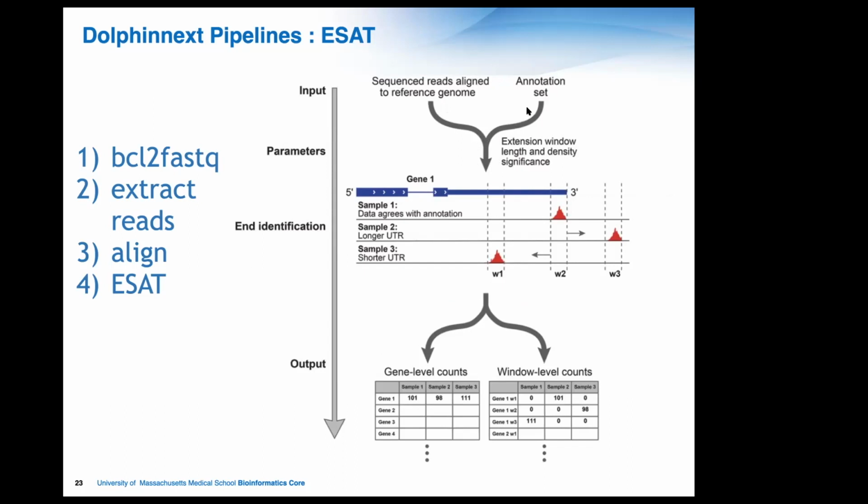So you can imagine that if a read aligns to, say, positions 10 to 100 on chromosome 1, that would be an alignment. But you might not know what gene belongs to positions 10 to 100 on chromosome 1. That's what your annotation set is going to tell you. It's going to be a reference that says, for these genome positions, it corresponds to this individual gene.